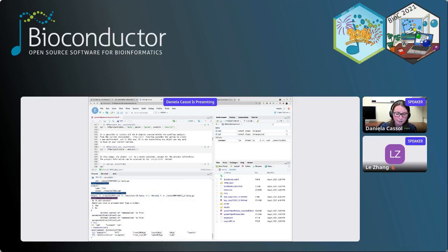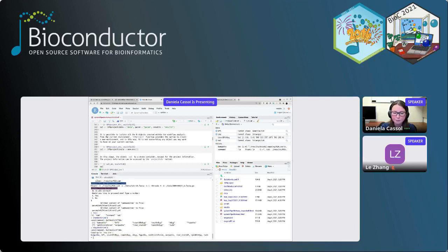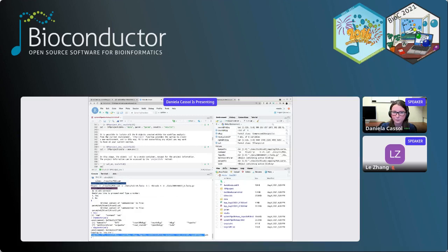And if I want to copy those objects to our current environment, I have a function called copyEnvir. I pass the name of the object. I can pass a list, but I'll be copying all of them. So I run that, and you see we copy all those files from the new environment to our current one. Up here, you can also see all those files.